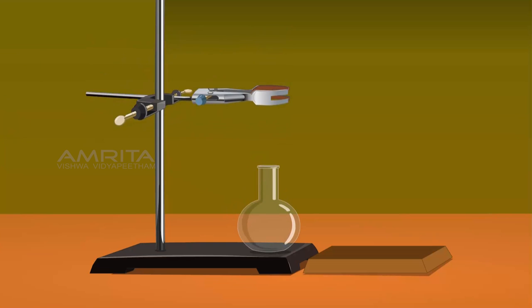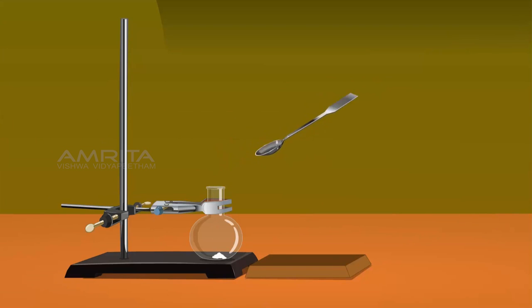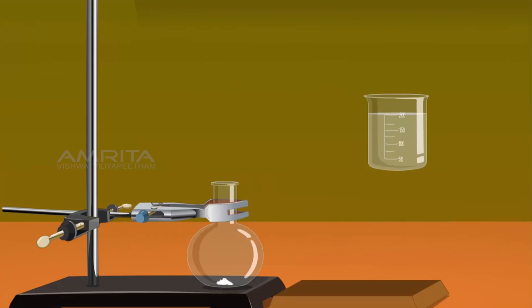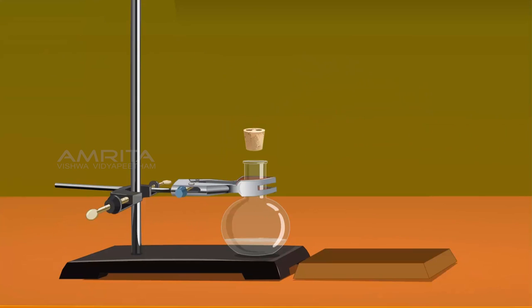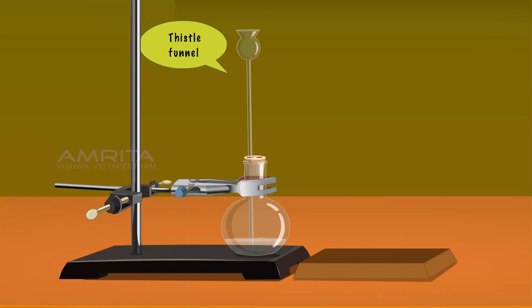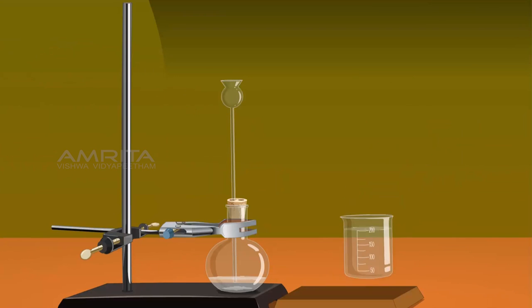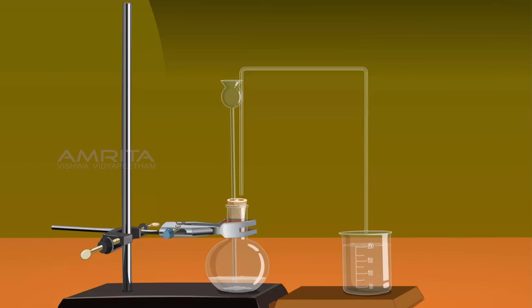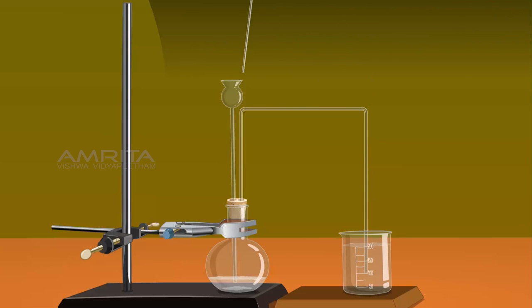Place the flat bottom flask on the clamp stand and clamp the neck of the flask. Using the spatula, take some sodium carbonate from the dish and put it into the flat bottom flask. Pour some distilled water into the flask. Cork the flask with a double board cork and insert the thistle funnel through one of the holes in the cork. Place the beaker containing lime water on another stand next to the flask. Carefully insert one end of the connecting tube into the flask through the hole in the cork, ensuring the tube does not touch the solution. Place the other end of the tube in the beaker containing lime water.